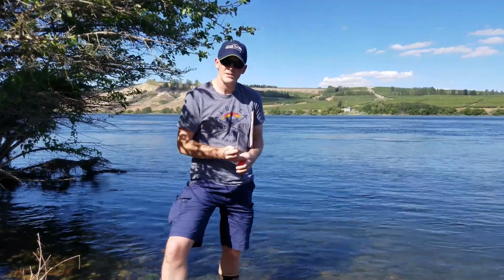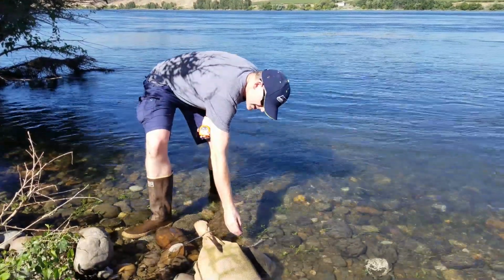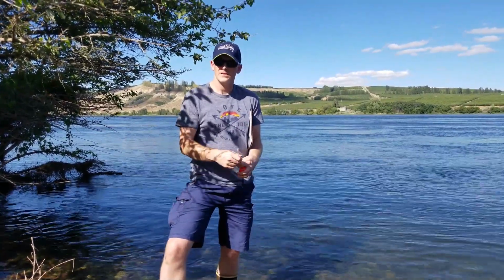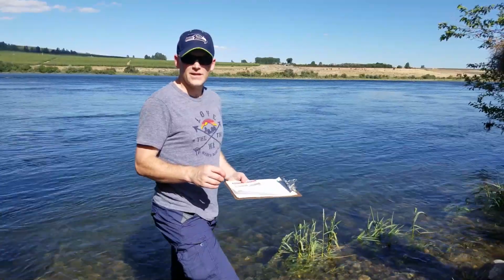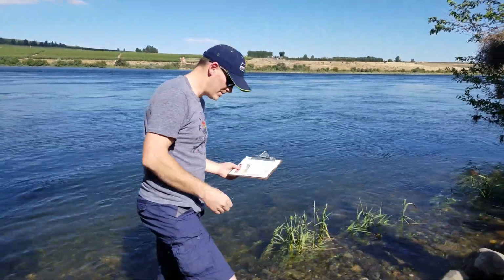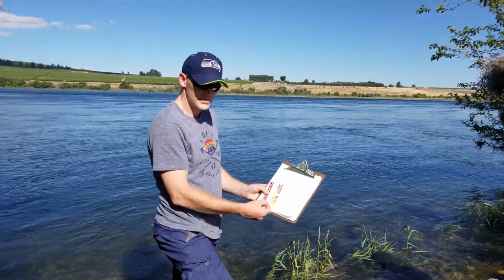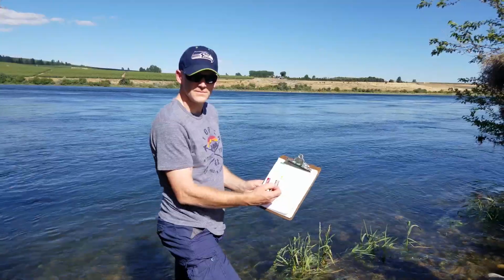You're also going to take temperature at 50% of the water column at the middle push point. Take that measurement, again record it on the data sheet. If the water is too deep to access the middle push point, take a temperature measurement wherever you can along the shoreline. After you've taken your depth and temperature measurements, next step is to measure pH. So take your pH strip, just dip it right in the river. Wait about 10 seconds for the color to develop and compare it against the color sheet. Then find your value and record the pH on the hard copy data sheet.